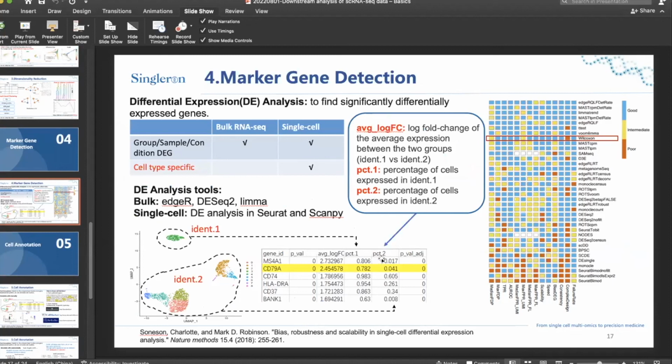However, when you are using different statistical tests, the p-value and adjusted p-value could be different. Genes with very different expression patterns should be identified no matter what statistical analysis you use, but for those with smaller changes between groups, the results could differ.